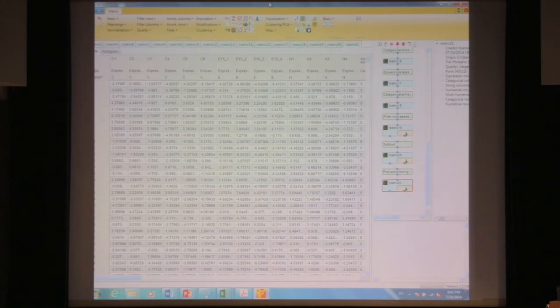I just want to add another comment on this. Basically, this is not a magic button to click. If you have time course data, then I would say fit a curve and impute based on the curve fitting, which will be much better than k-nearest neighbor imputation.